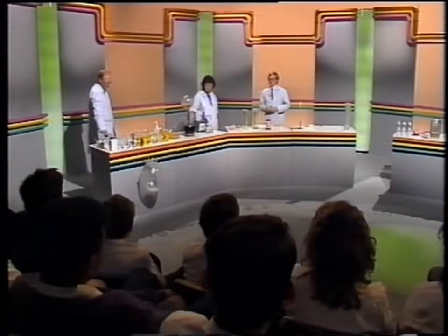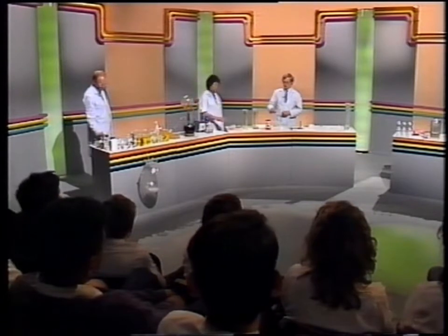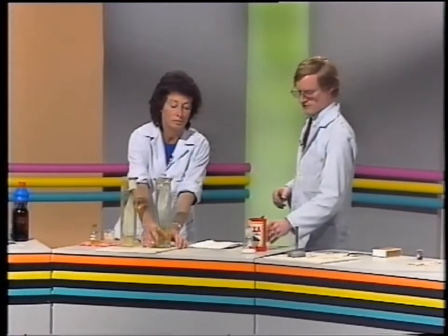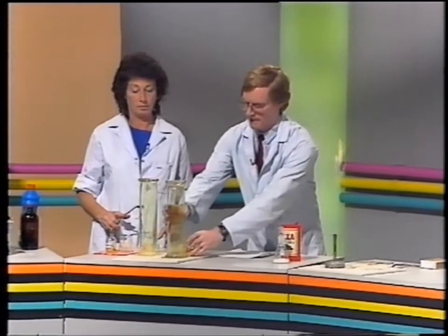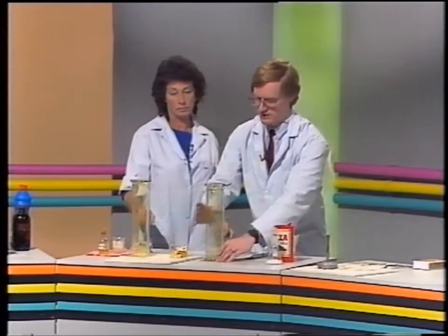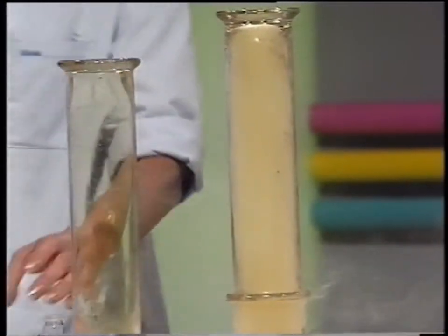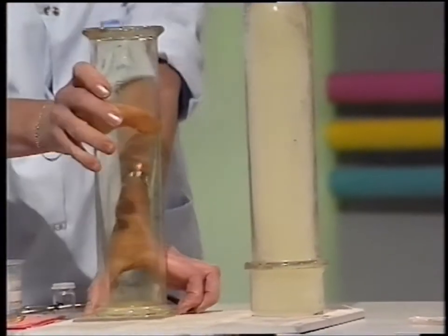Right, now chlorine is an extremely reactive element. Chemically it's very reactive, it can combine with a lot of other things. And we're going to show you some simple experiments here which illustrate how it can combine. The first one is to take an alloy which contains mostly copper and to just allow the copper and the chlorine to come into contact with each other. Now as you can see there's an instant reaction producing clouds of a new chemical.